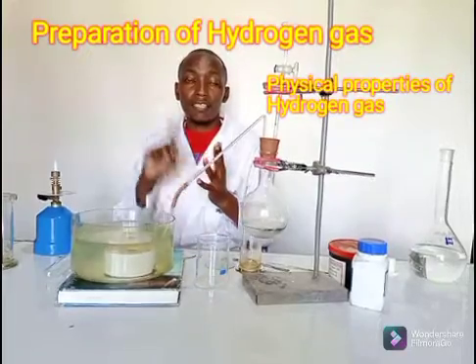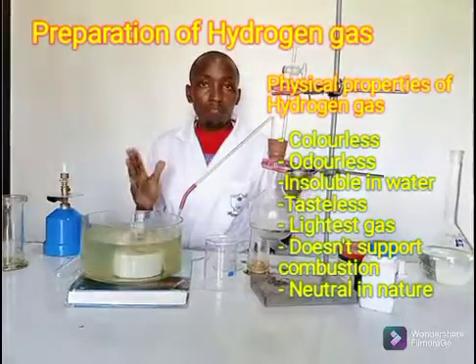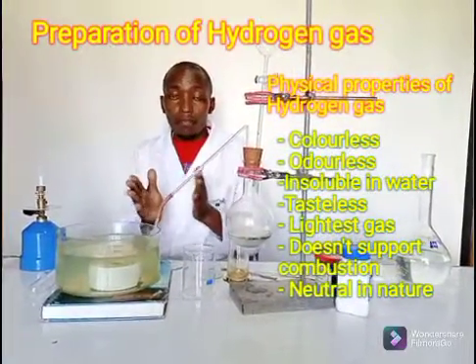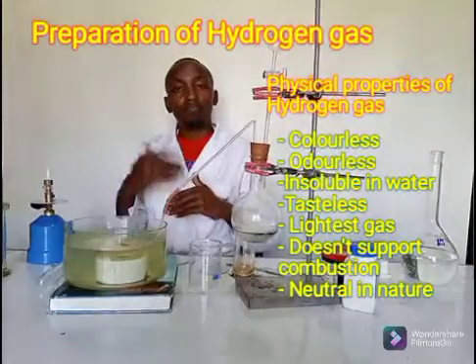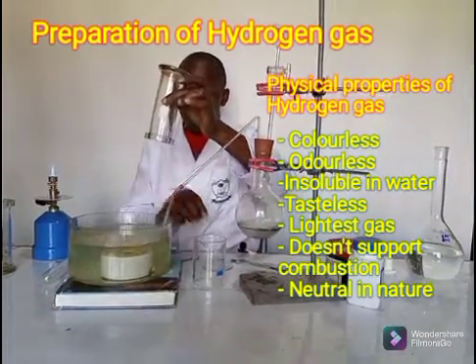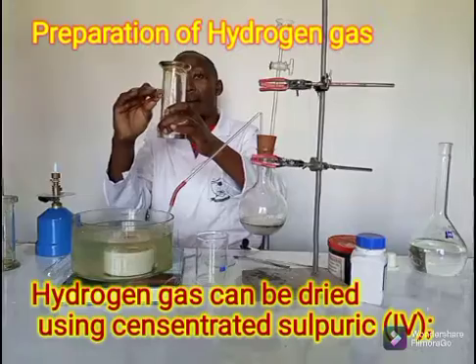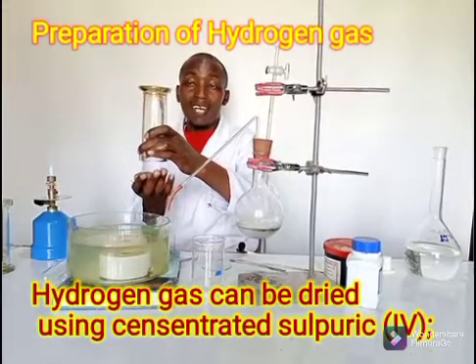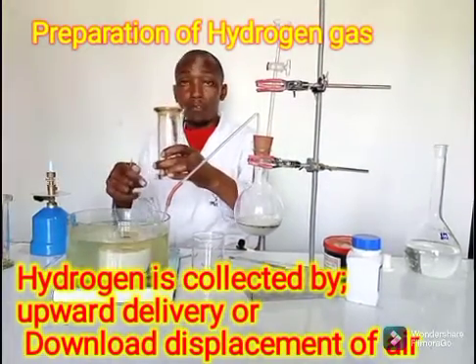The hydrogen gas I prepared was colorless, it had no smell, it was insoluble in water, and we usually say it is also tasteless. Hydrogen is a very light gas. For this case we collected it over water. In case we needed it dry, we could have passed it through a drying agent — for instance concentrated sulfuric acid — then collected it by upward delivery, whereby the delivery tube faces downward bringing the gas in from the bottom. Because the gas is very light, it will occupy the upper part of the jar. Otherwise that method is also called the downward displacement of air, because once the gas occupies the upper part, the air that was inside is displaced downward.